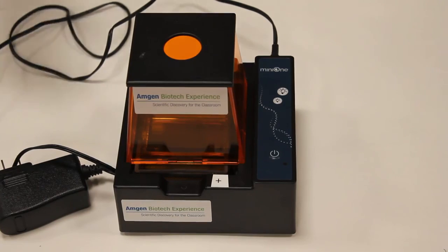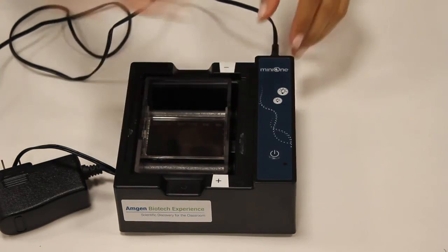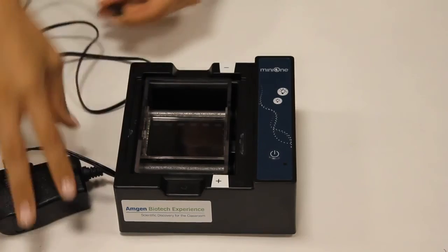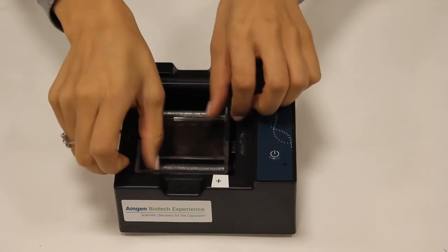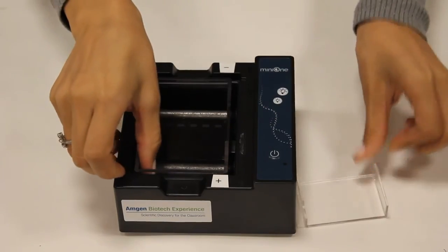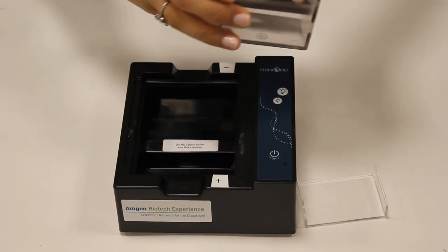Once finished using the gel box, rinse the tank with DI water and place it upside down to dry.